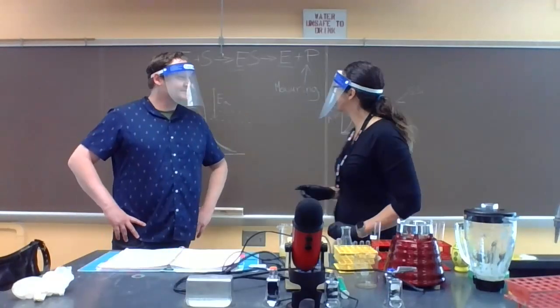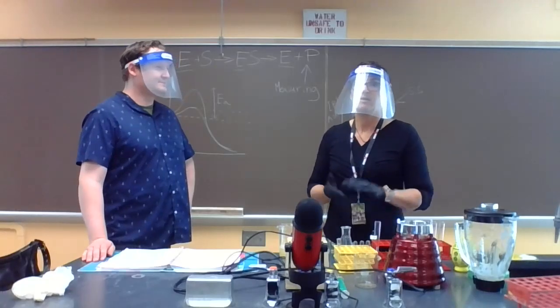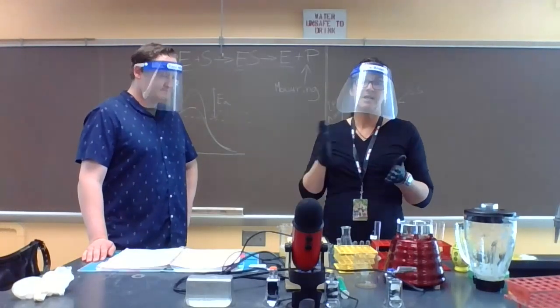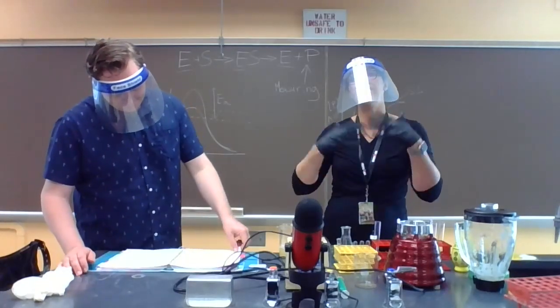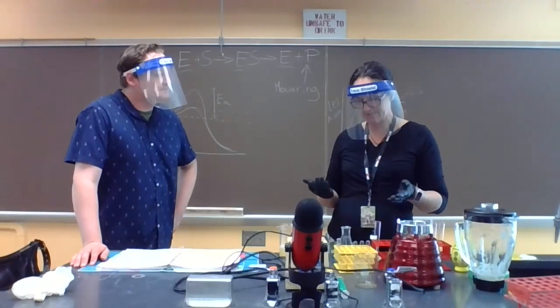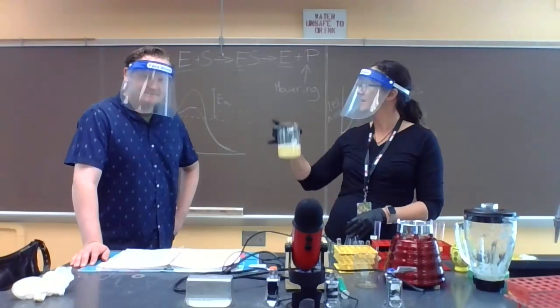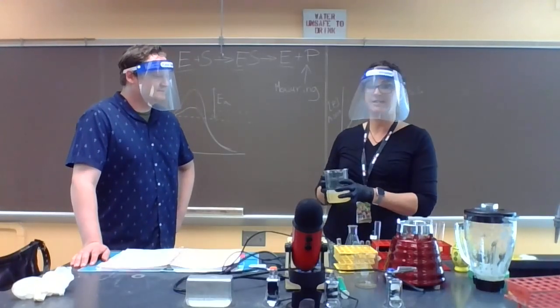And because in the first reaction we're going to vary the amount of enzyme, we still want our reactions to have a constant volume, right? So in order to make up the extra volume and keep the volume of the reactions the same, we're going to add a little bit of inactive enzyme. And the way we're going to get inactive enzyme is we're going to boil some of the potato extract to inactivate or denature the enzyme.